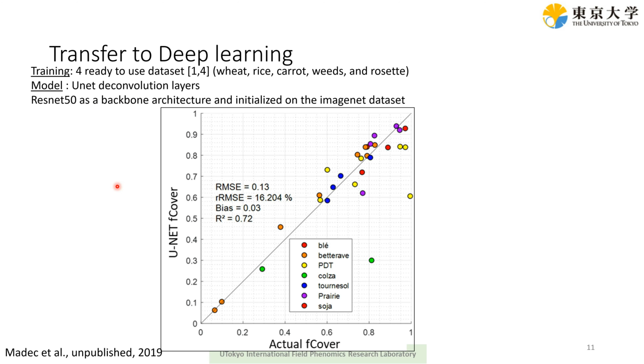by the collaboration with the Inria France team, Simon started proposing a deep neural network that is still being tested at the moment, but we are expecting a good enough global model to handle all the cases and segment the green pixel zone.